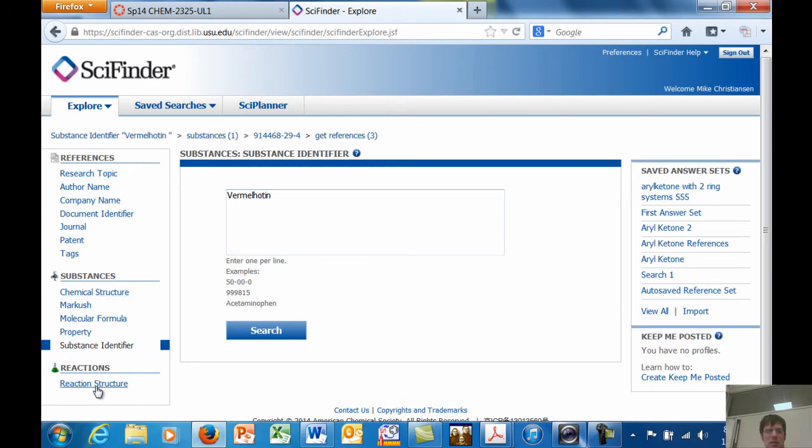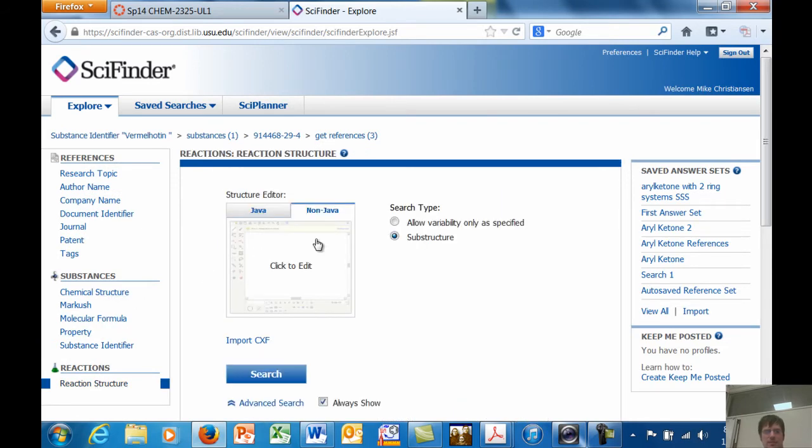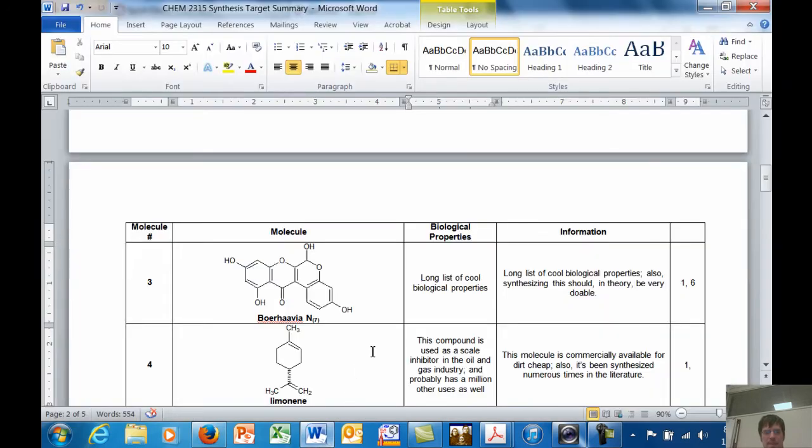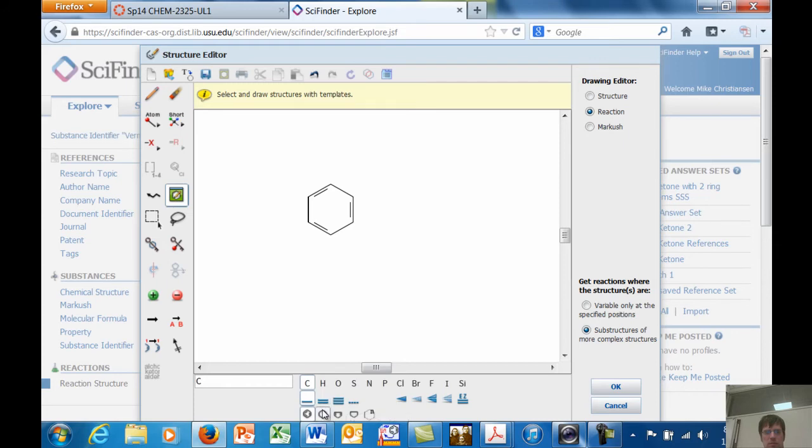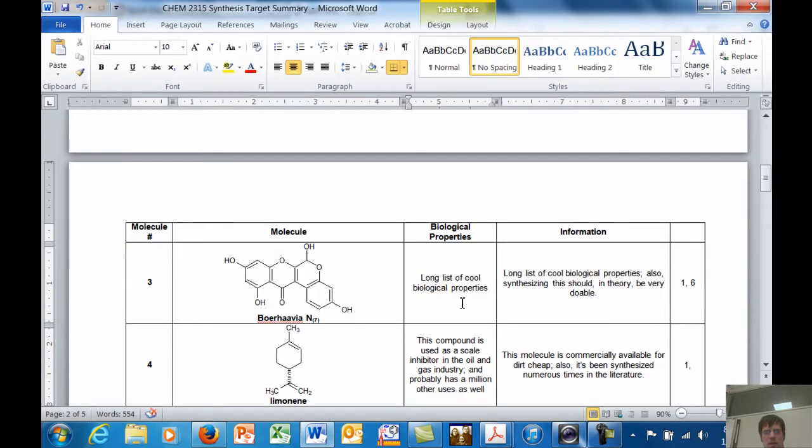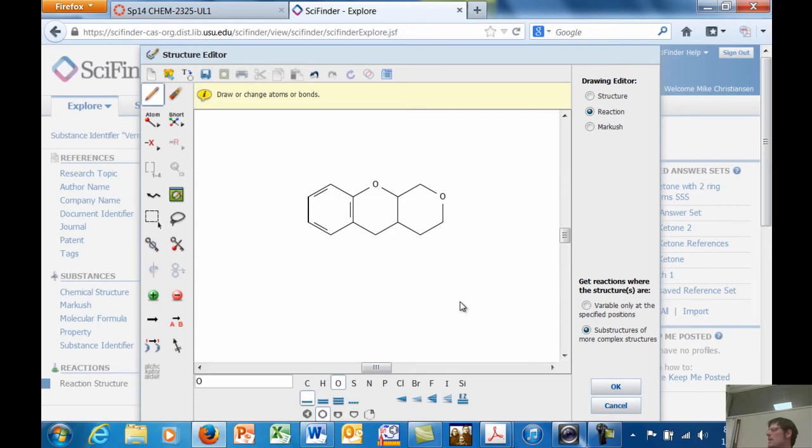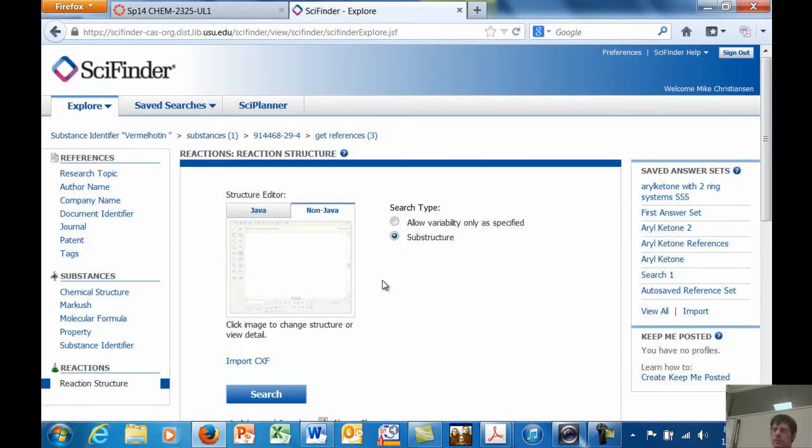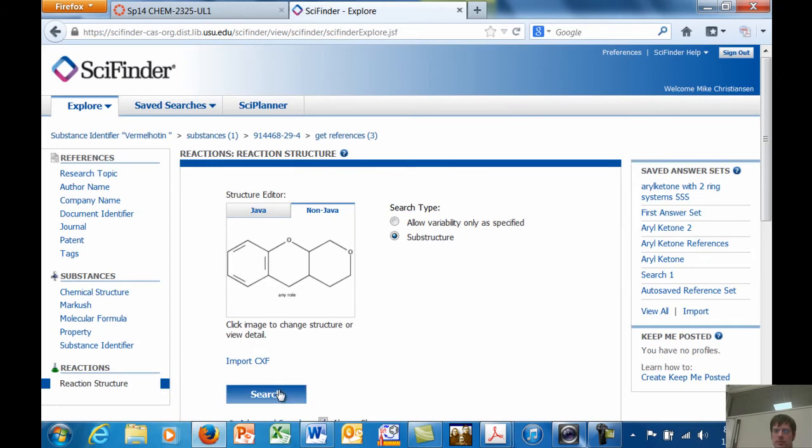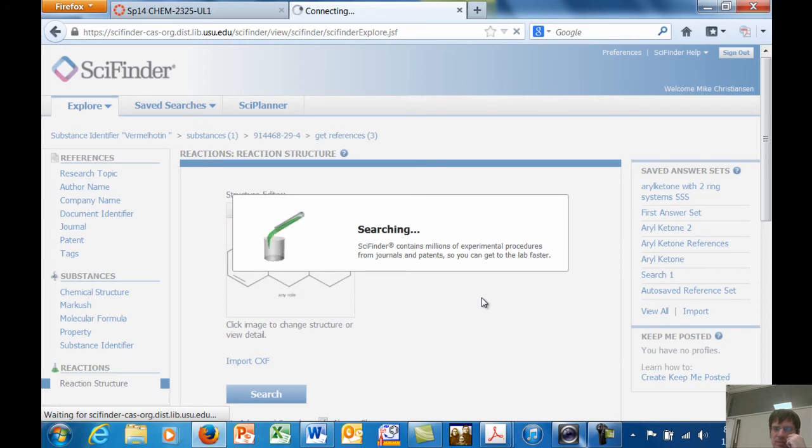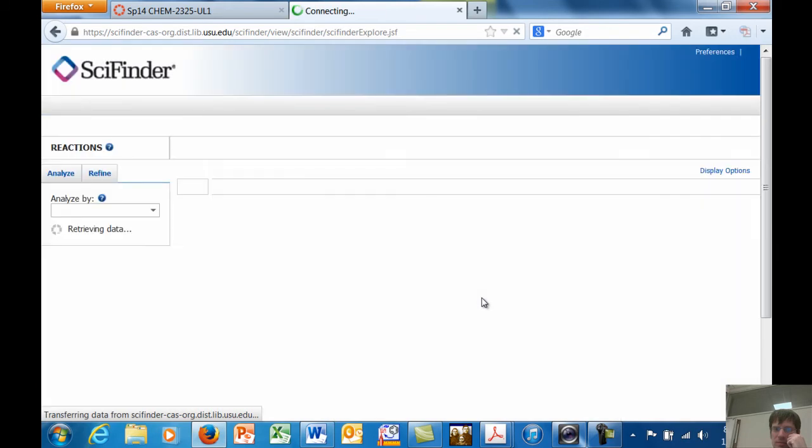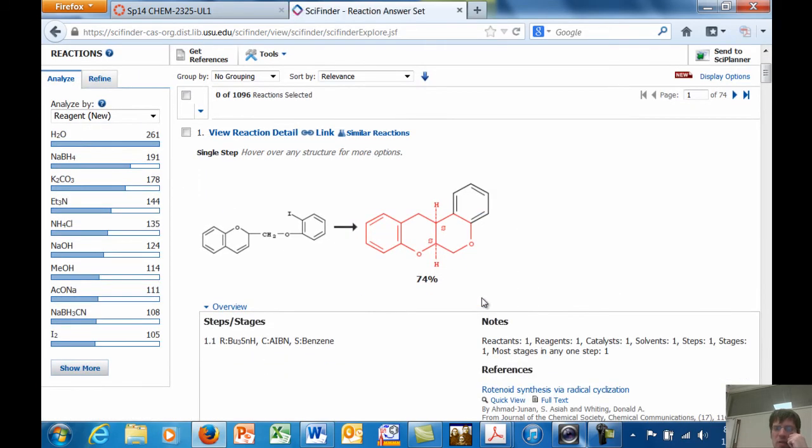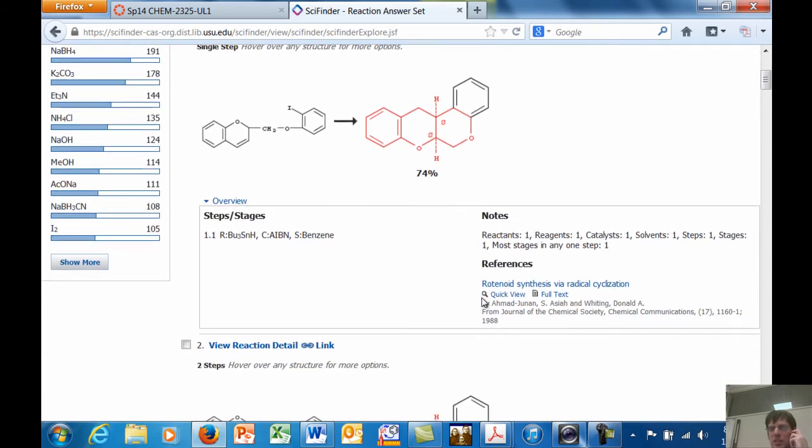Let's go back. We'll go to reaction structure. Now I'm going to make my structure even more generic. Okay, I'll put an oxygen here and an oxygen over here. So see, I'm making it even simpler than the one that we have in there. I'm going to hit okay. I'm going to click search and see if anyone's made anything that looks like this.